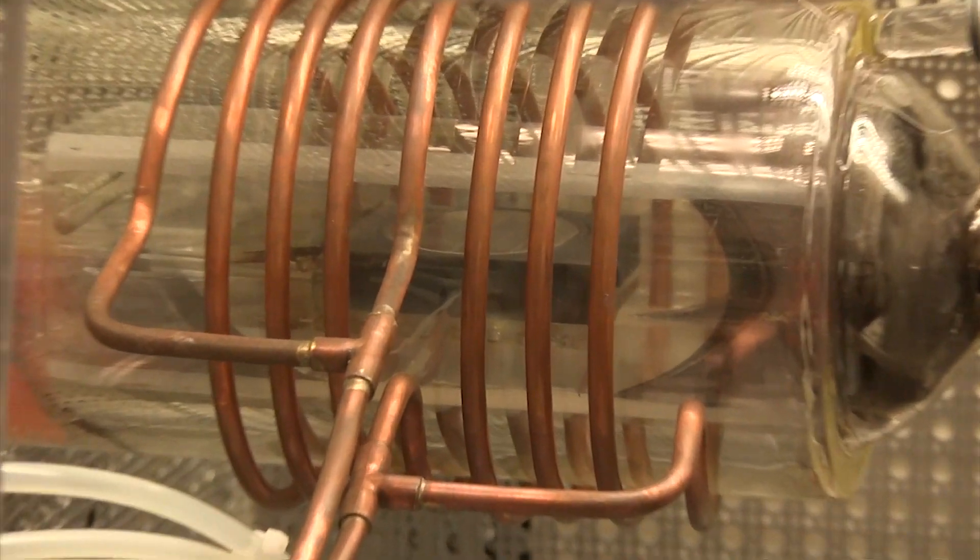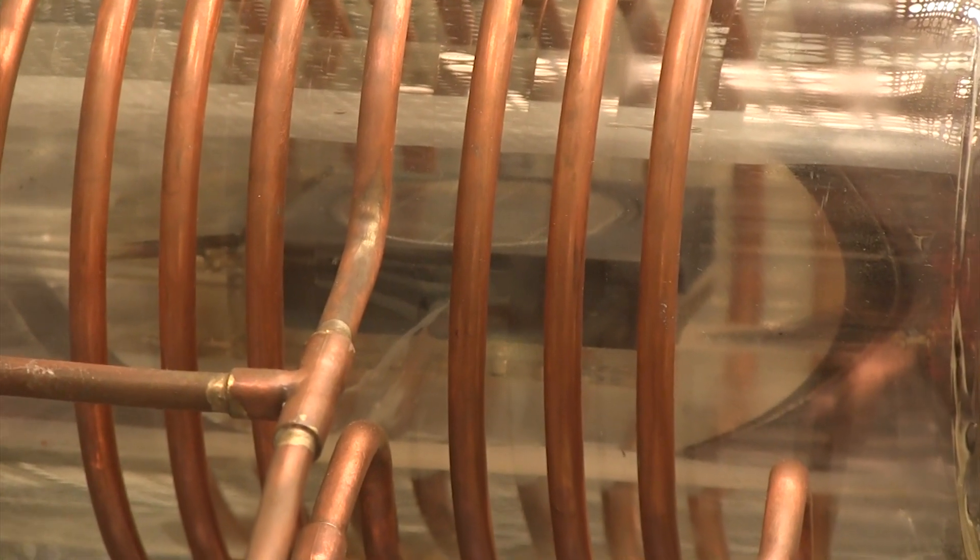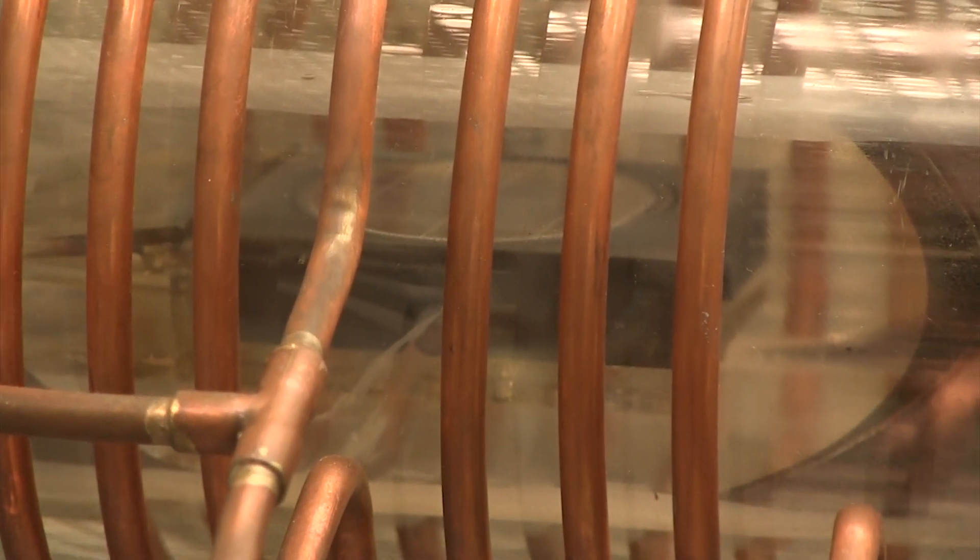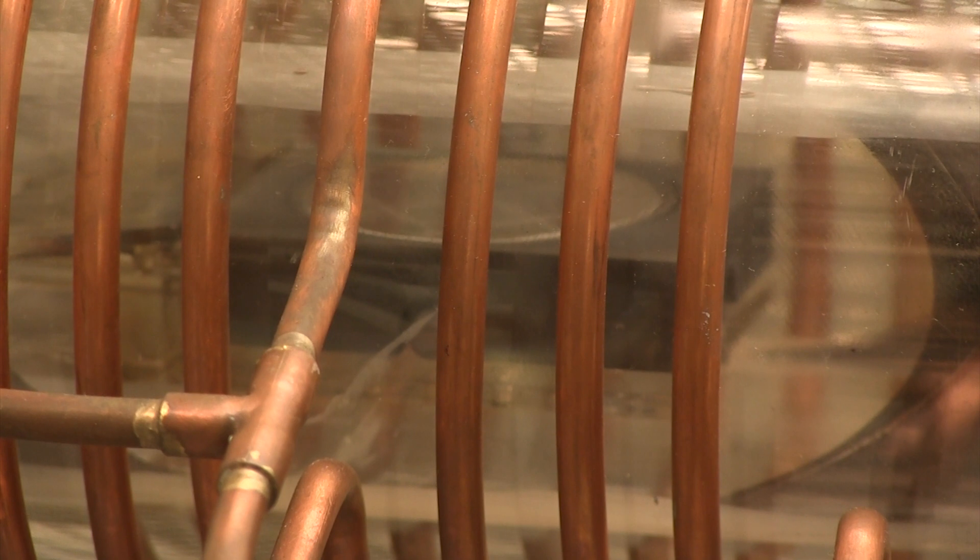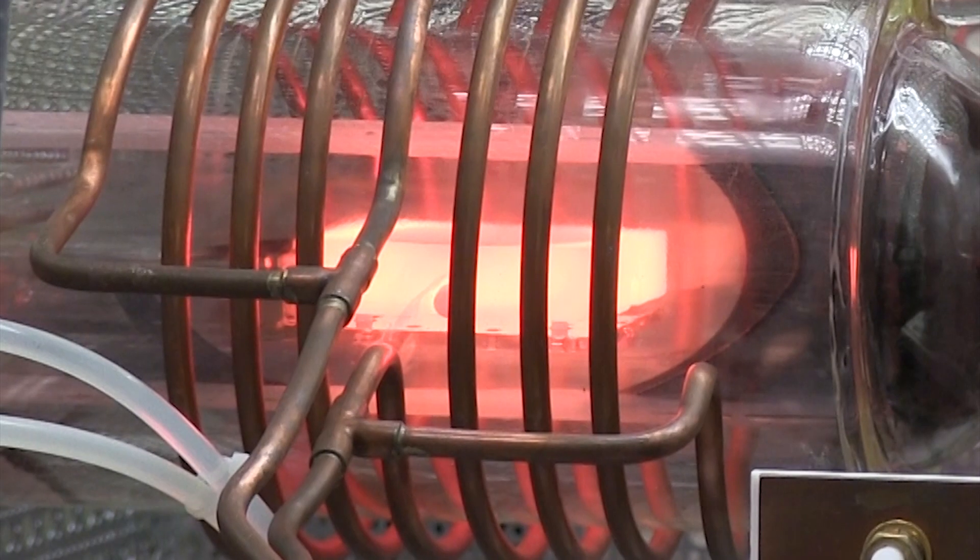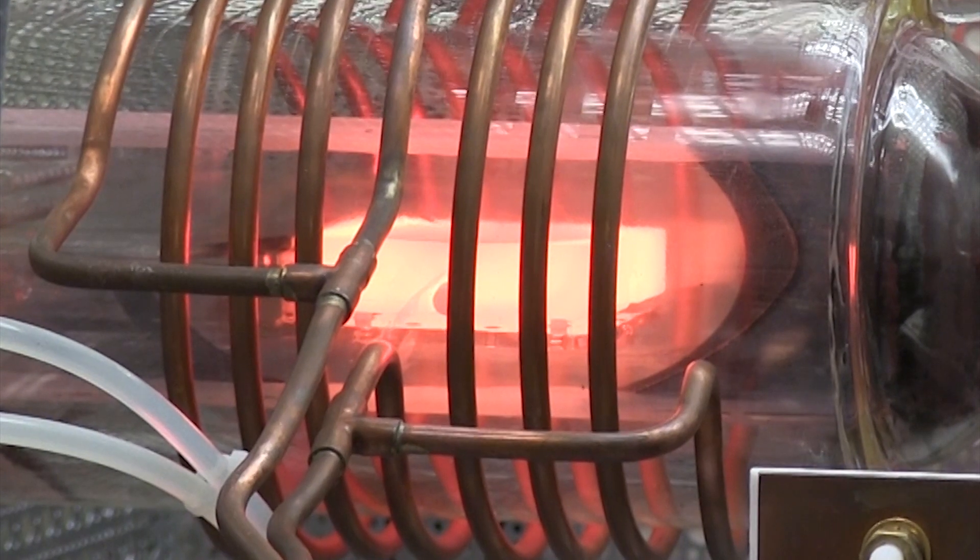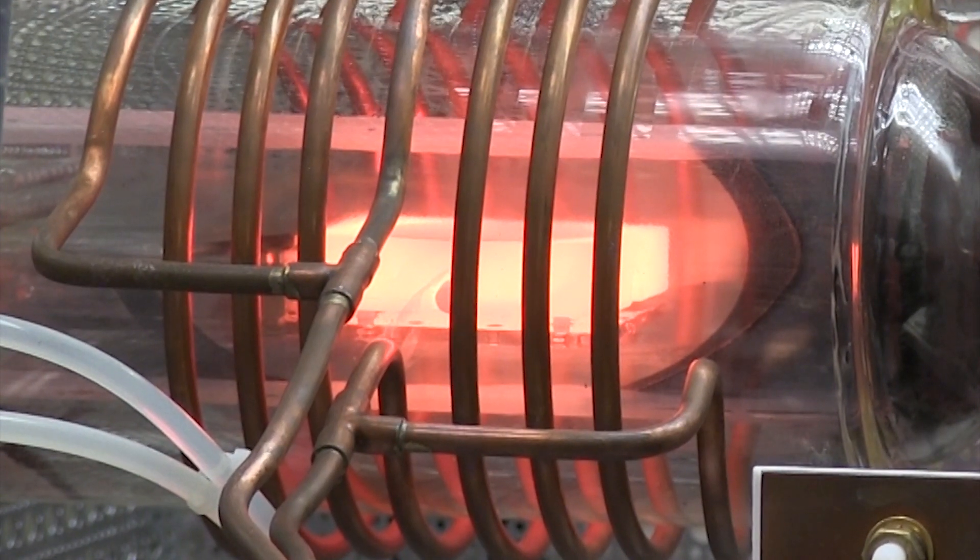In our thin-film facility, we grow single-layer 2D materials using various systems that enable atomic-level control of monolayers. These systems allow us to grow 2D layers over wafers that are 2 or 3 inches in size, a critical ability for device fabrication.